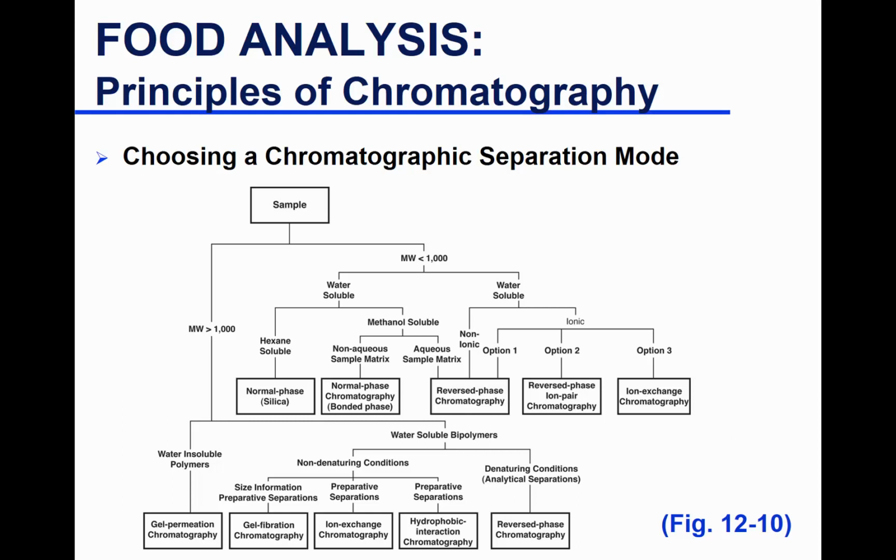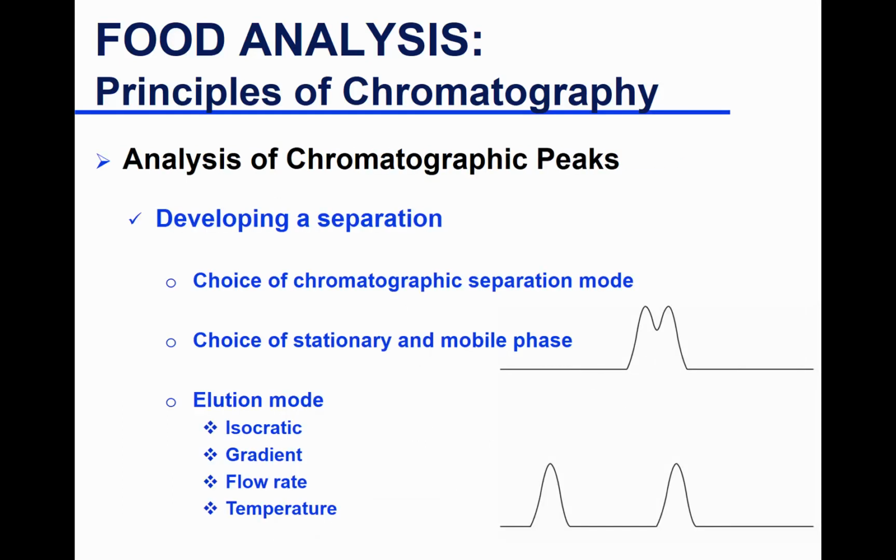Yes. What do you have in the lab? What's available? What column do you have? What expertise do you have? You can start there. If you don't get good separation, you say, okay, this is not getting me the separation I want. I will go to the second reference I found and ask my PI to pay a little more money and get the column I need. So you have to do some investigation: what's published, what you have available in the lab, what you know about your solutes, how much separation you need, and work your way through.